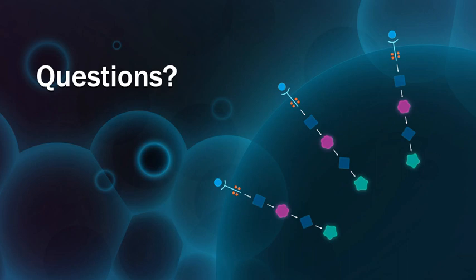The next question we have is, why would you use DigiWest high-content protein profiling rather than something like RNA-seq? Well, high-throughput RNA sequencing, known as RNA-seq, does provide better quantitative measurements and more extensive gene coverage than proteomic-based assays such as DigiWest. In DigiWest, you're directly measuring the protein concentrations. But there's a lot of variations in transcript abundance that do not necessarily reflect changes in the corresponding protein abundance. So therefore, oftentimes both approaches are used to best correlate the data obtained at the RNA level with changes associated in protein levels.